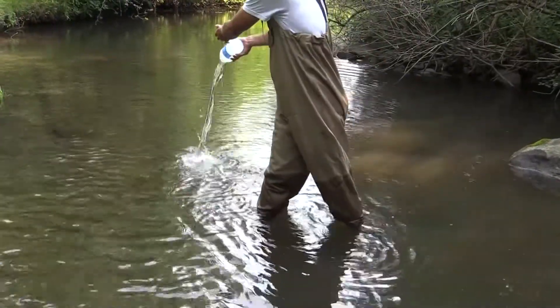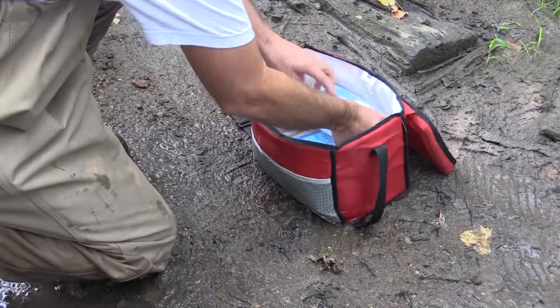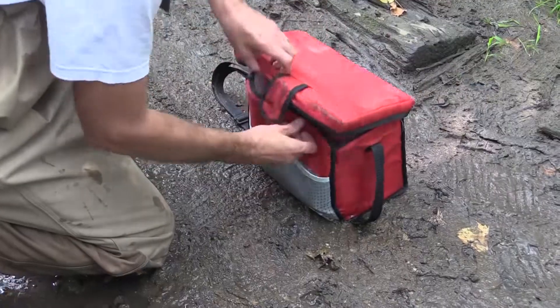Following the third bottle rinse, collect the sample and return to the cooler. Take care to avoid collecting solid matter like leaves, algae, or organic matter.